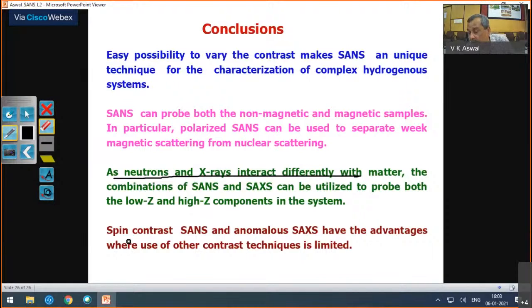In the neutron interaction, H has a different scattering length compared to deuterium. The chemistry remains the same, but the contrast is so good that you can mix D2O and H2O literally in a beaker and make different parts of a particular particle visible or invisible. And the same thing goes for when you do a spin variation, you could see that.